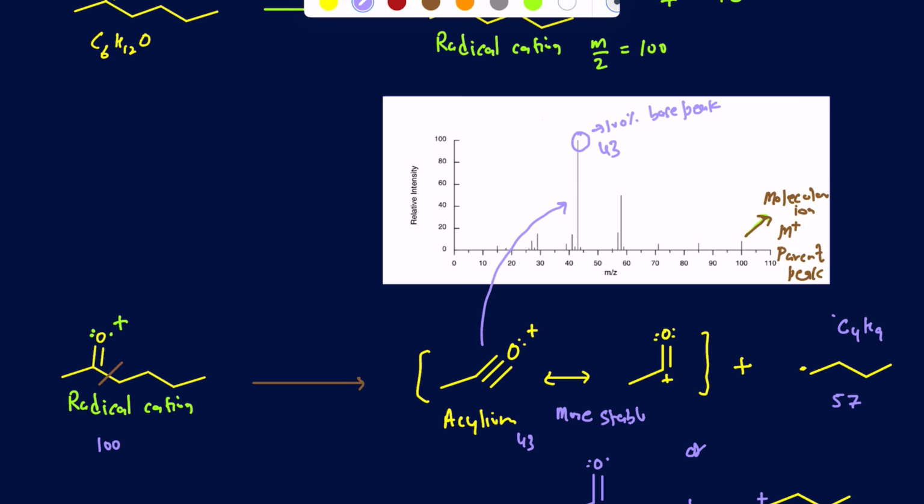So that's how you want to figure that out. Now, do I see 57 in there? That's the question. What if I actually make this carbocation here, even though we said this is not going to be stable, so you should not be looking at it in here. But let's just see to double check. If I make this, then I should be at a 57, because remember, the radical doesn't really show up in the mass spec. It's only going to be the carbocation, or the radical cation, that shows up in the mass spec. So this at 57, let's see if we have it.